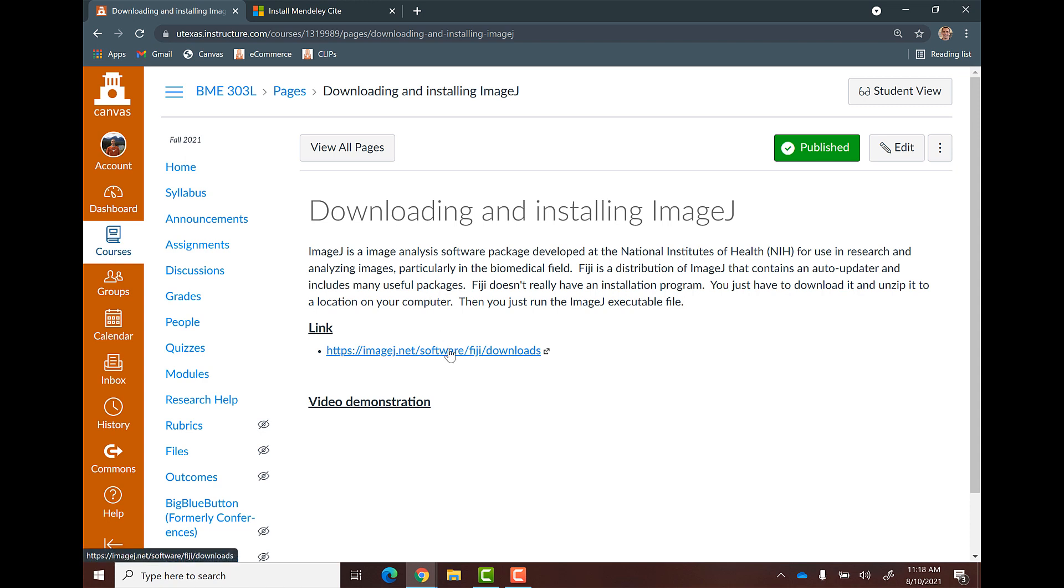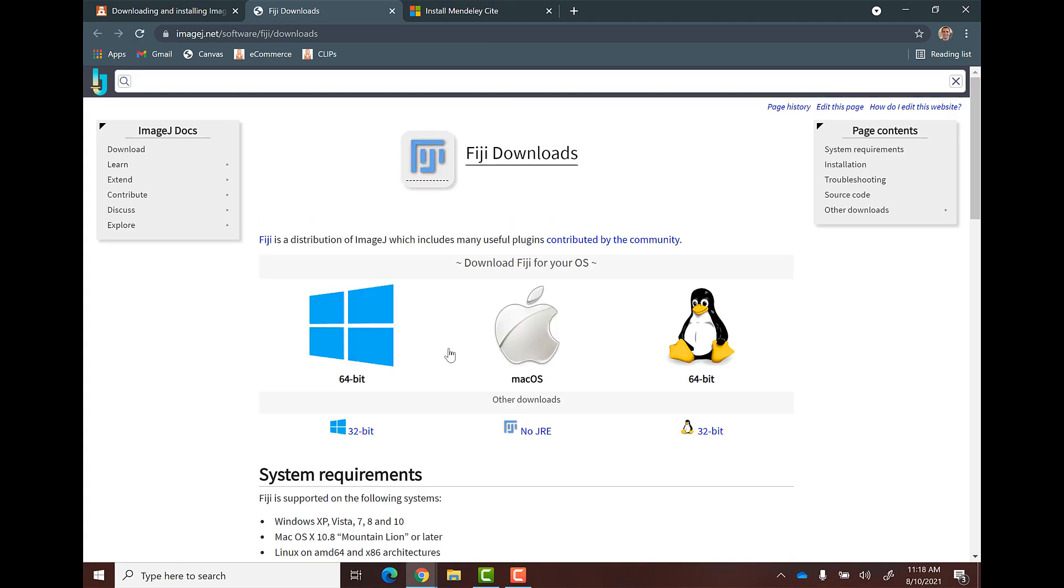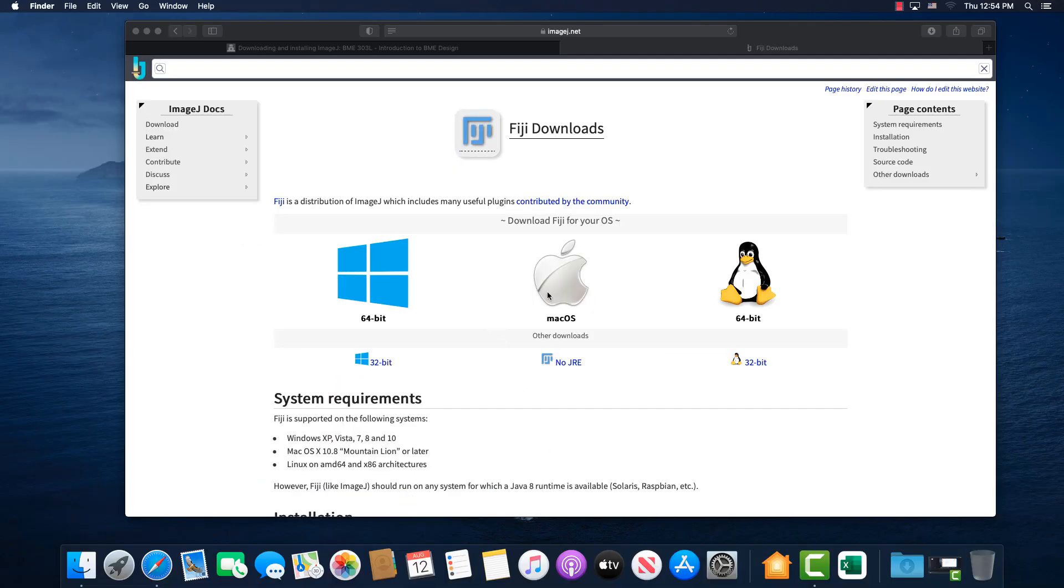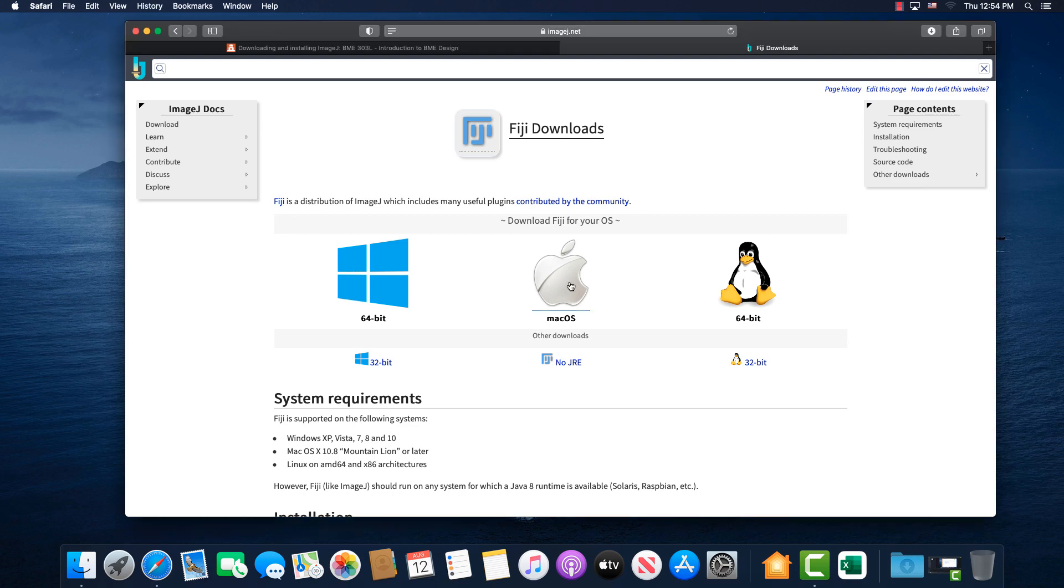So you're going to click on the link. All right, I'm going to show you how to do this on the Mac since it's a little bit different than the Windows. But really, you just have to click on that Mac OS button. It will go ahead and download.